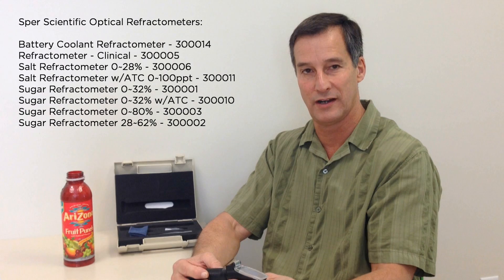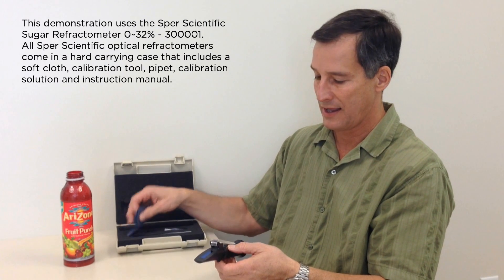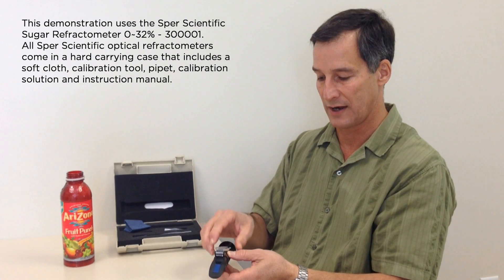Today I'll illustrate how we calibrate an optical refractometer. First, we simply open the prism cover and make sure there's no dust on the lens using a soft cloth so that we don't scratch it.